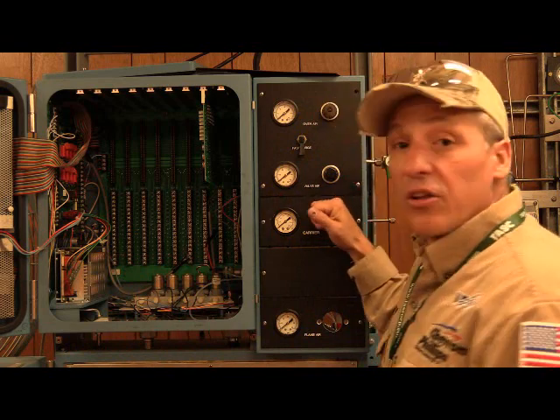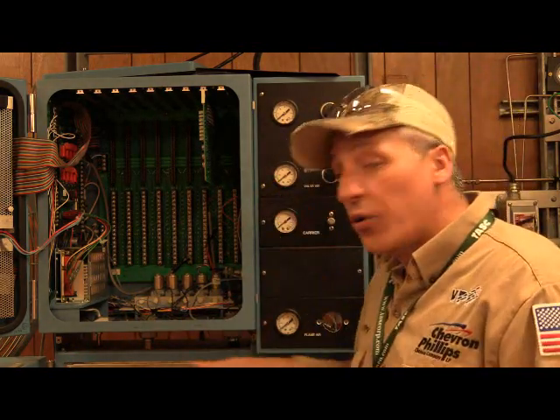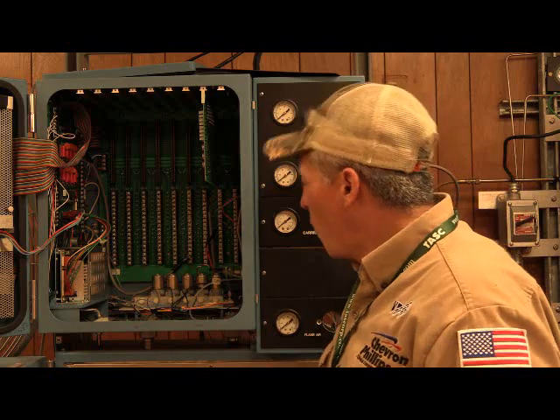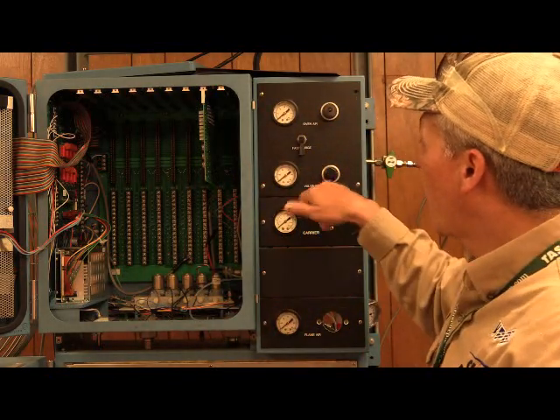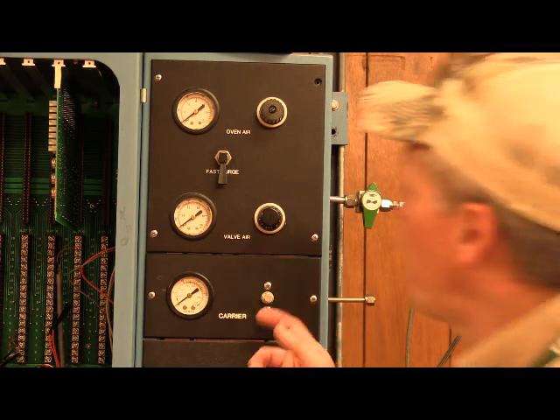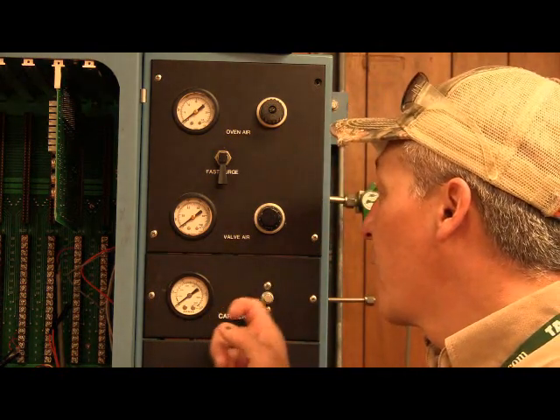You will set your carrier regulator with your carrier gas coming in, and that is what's going to push everybody through the GC, separate them out with the columns, and then make it to the detector. You've got your valve air for stroking the valves inside of the oven. Let's talk about just these three right now. Your carrier regulator for your carrier gas to push everybody through the column, separate it out, make it to the detector. Carrier gas regulator, super important.